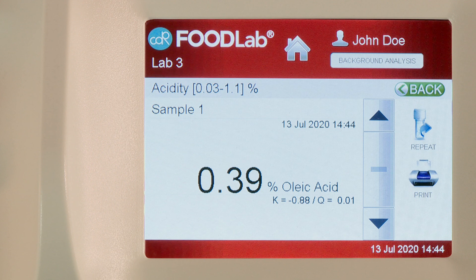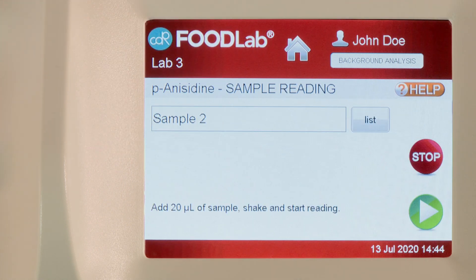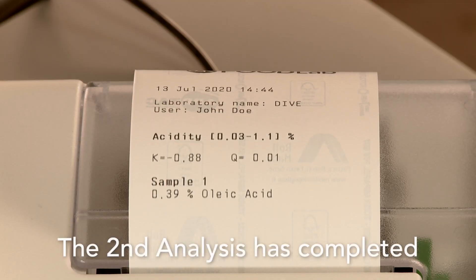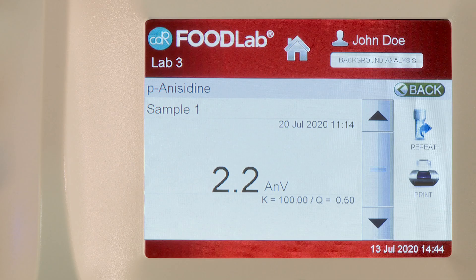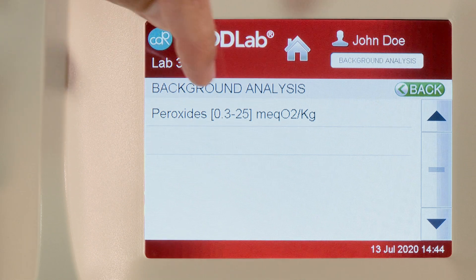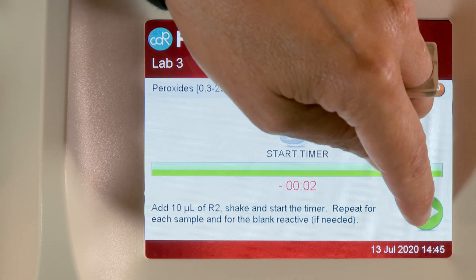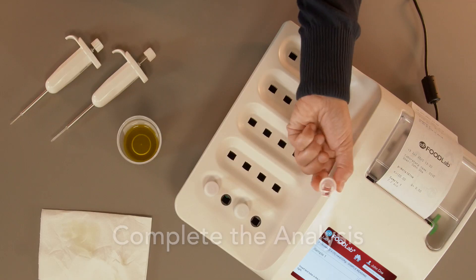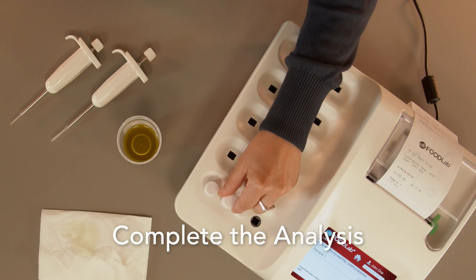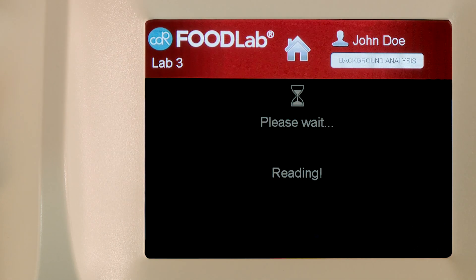Press Background Analysis to go back to the previous analysis. Then, press Background Analysis to go back to the previous analysis. Then, press Next to start the photometric reading.